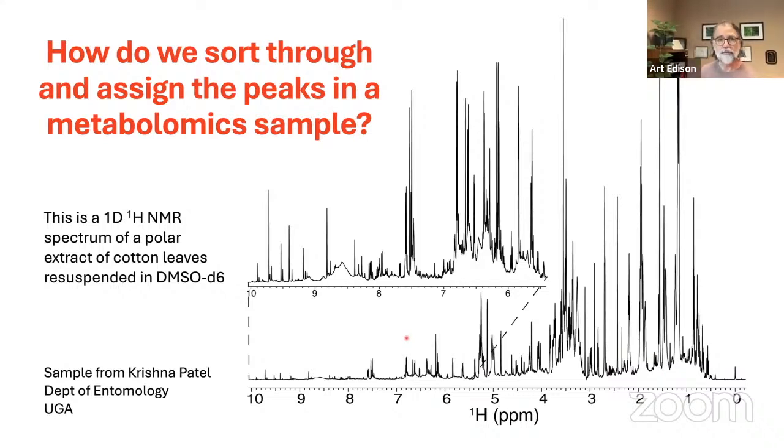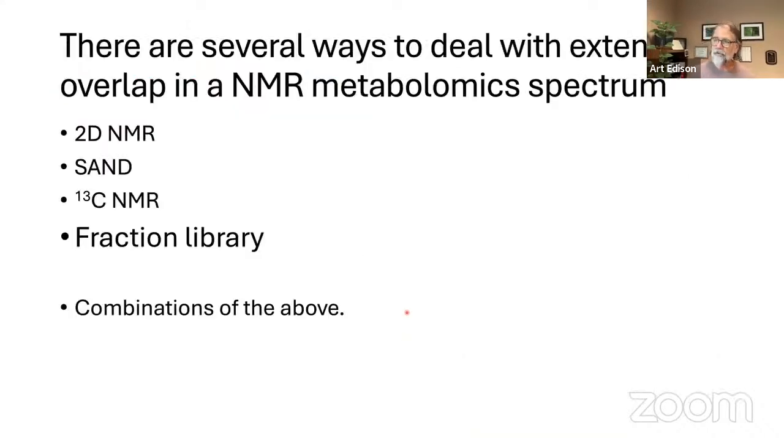And there are several ways of doing that. We've alluded to, but we haven't really spent a lot of time talking about 2D NMR, general 2D NMR methods. There's a lot out there right now that you can find. We use 2D NMR quite a lot in our lab, especially Colmar database matching, where you've seen references to this a few different times in my talks.